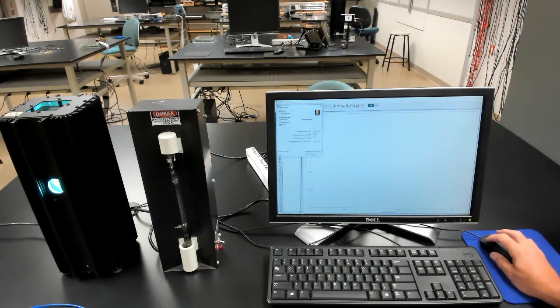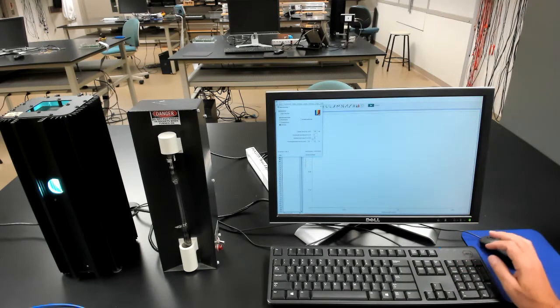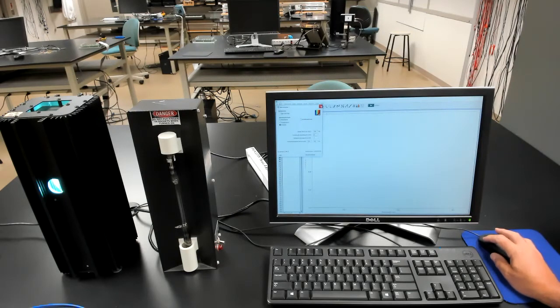The next parameter is called wavelength smoothing. We don't want to do that, so we'll leave that set at 0. And samples to average. You might want to do this, but I'm going to leave samples to average set to 1. The last parameter here is wavelength range, and we'll use the entire range, 380 nanometers to 950 nanometers. Very good, we're done.